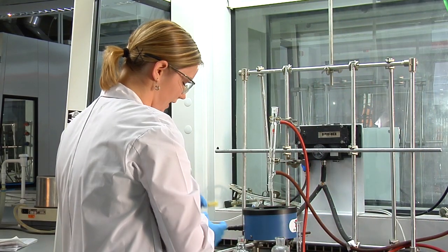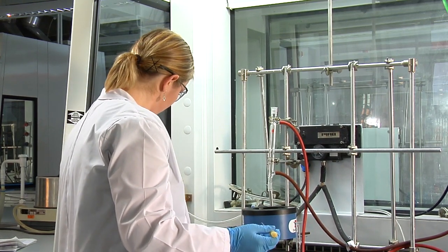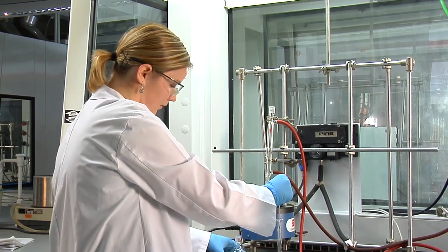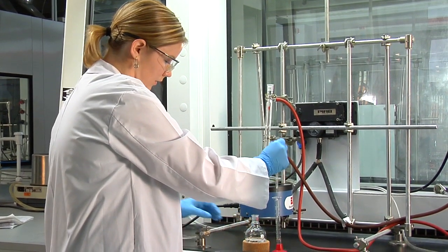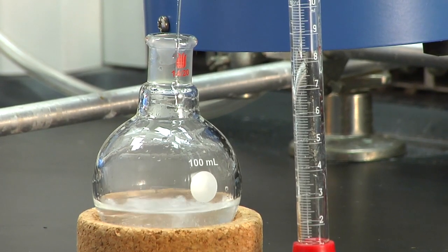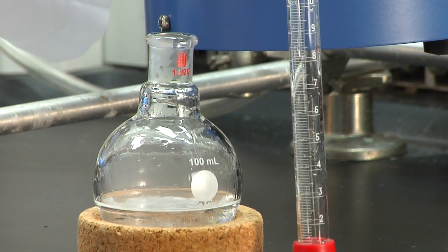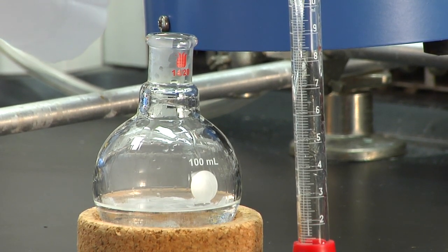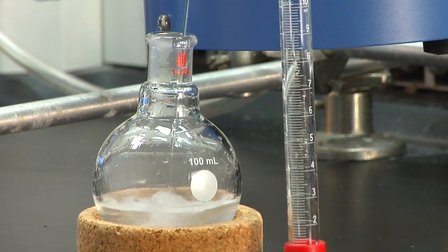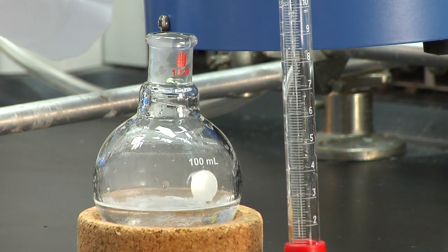So now we're going to add that into the reaction flask. And you can use your pipette to add this because you don't want to splash it everywhere. So again, we're adding the sulfuric acid into the reaction flask where the methanol and the benzoic acid are. And this is just going to help us to dissolve it here. And then we're going to be setting it up on the reflux condenser.